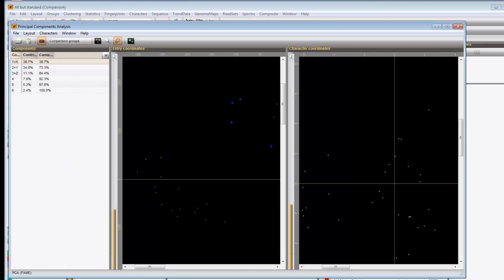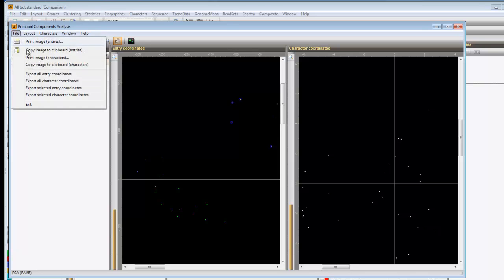The coordinates of the plot can be exported with file, export all entry coordinates.